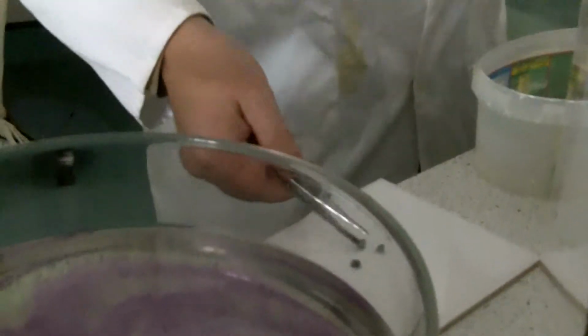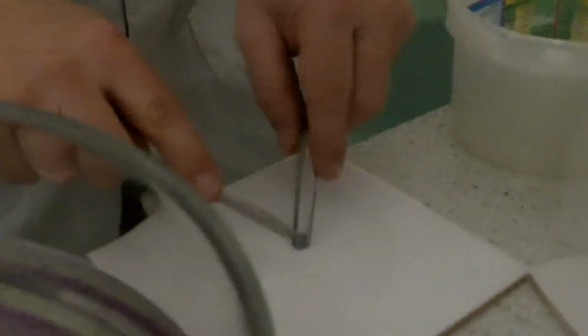There are things on YouTube where people have done that, thrown big chunks of it into lakes or swimming pools, and those sorts of things. What happened? Oh, you'll have to find out. It goes bang. Okay, that's quite a big piece of potassium. Maybe I should cut that down a bit. Well, even I'm scared to use that much.